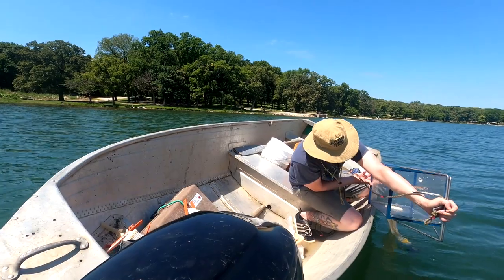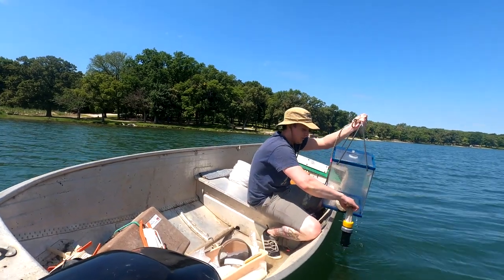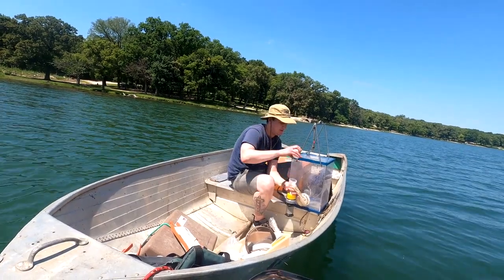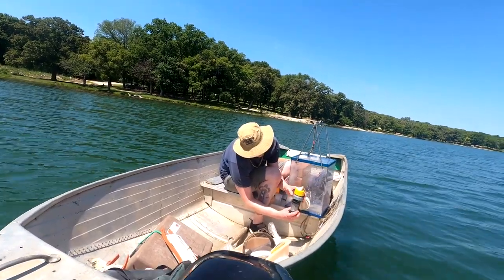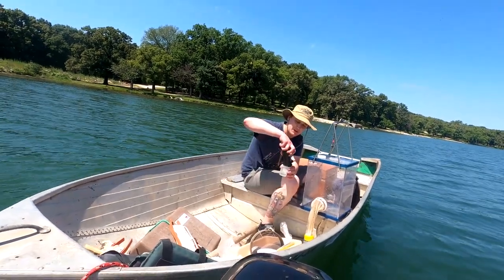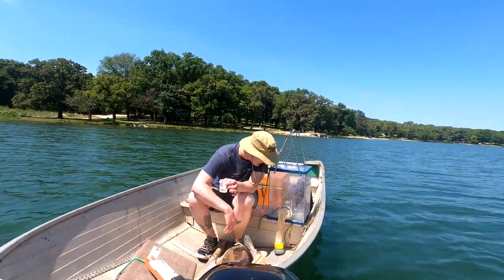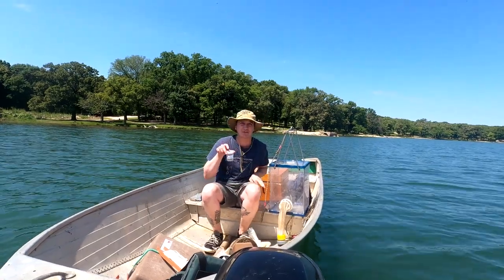By draining all the water, it allows us to take a quantitative sample. I'll pull that up and I've got another collection cup ready here. I'm going to undo this black portion on the bottom of the net and pour it into our sample cup. I'll just cap this — it'll be good to go after I add a little bit more water.